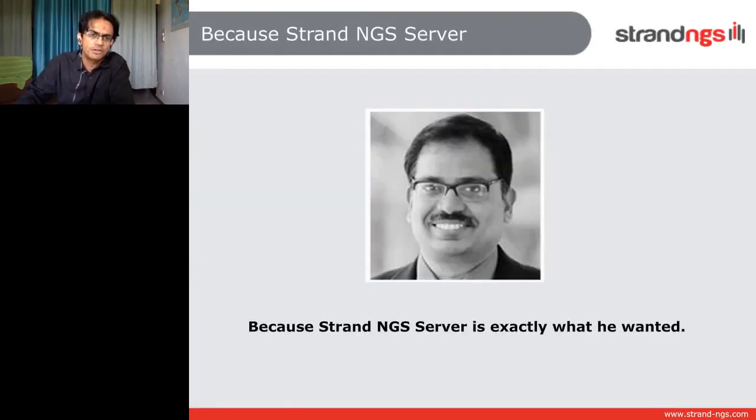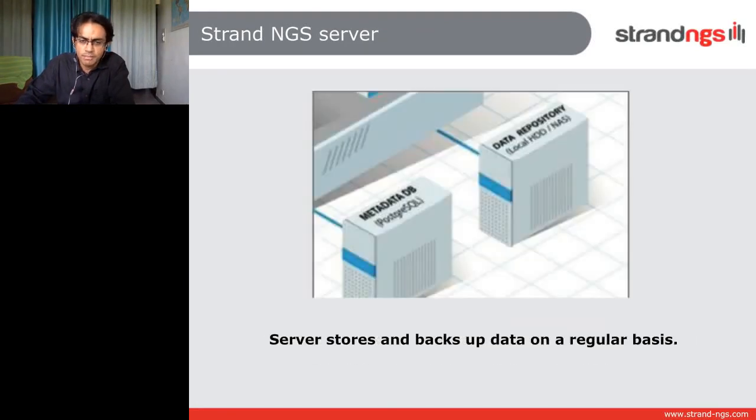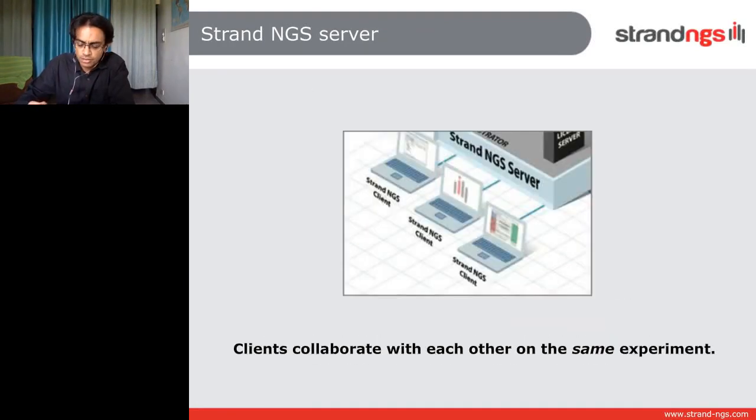And depending on the number of compute nodes available to you, you can have several experiments running in the background, and those experiments can go on for as long as they want to, but at the same time, each client is viewing either an experiment that's already done or they're viewing something else. That's exactly the whole point of Strand NGS Server: to separate computation from visualization and to separate either of those things from storage. And that's what Strand NGS Server enables.